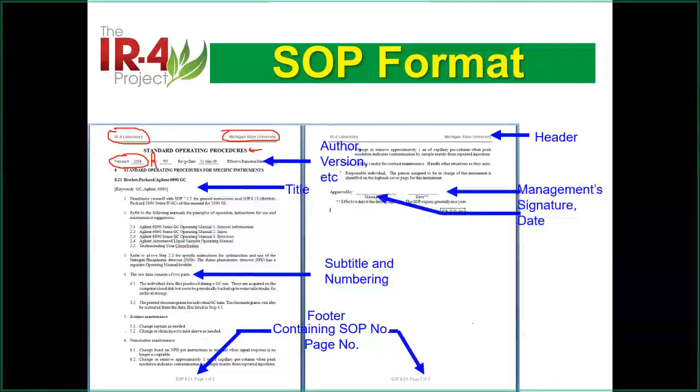Okay. Then we will say the effective date and the effective ending date there. Typically the effective date is when it is signed here. So we will have the title here, how you do the work. This is the GC 6890. Then you will have the details, how you do the work. It does not have to be only 2 pages here. It could be 20 pages, 15 pages. Typically, we make it less than 10 pages. It's easier to handle. So that's in the footnote there.